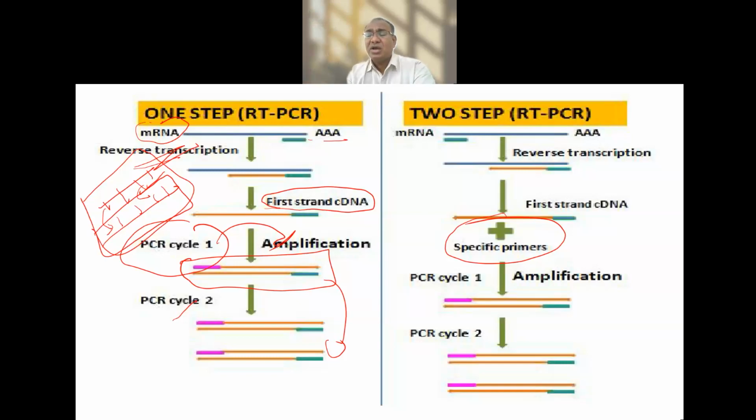So I vaguely think that the tissue which is given to me might be liver. I am looking for hepatitis virus. I have some primers according to the virus. I throw that into the fluid or liquid. Got the point here? Because I am looking.